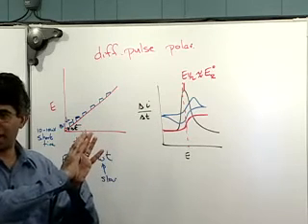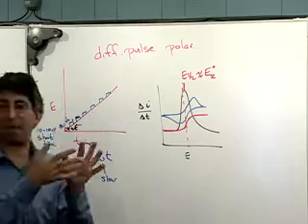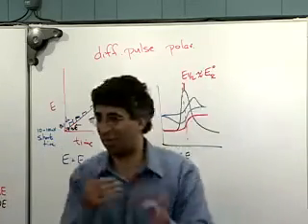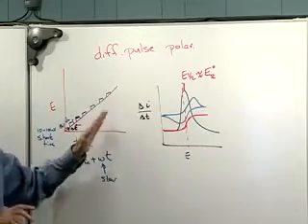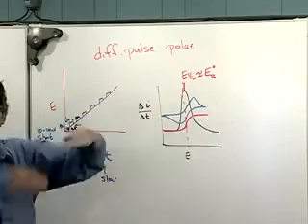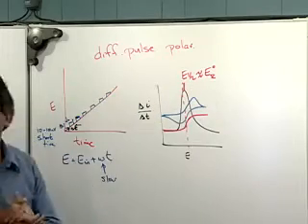anything else. That is, there is not a nice mathematical framework that would let you look at mechanistic information doing this. Things are just too complicated here, and you're not going to be able to distinguish subtle changes in the width and height of this peak. That's going to let you know what the mechanism is.